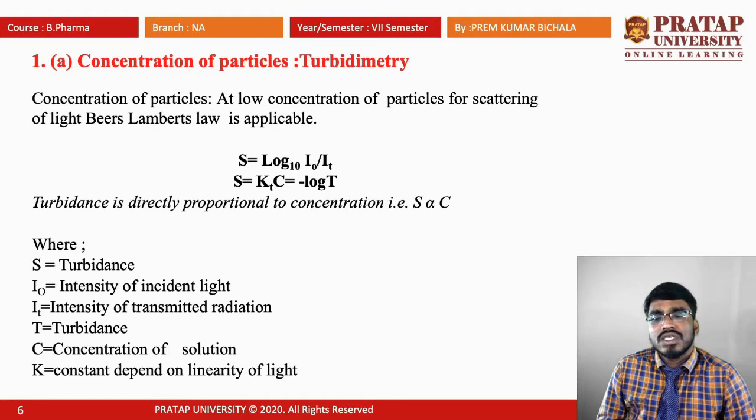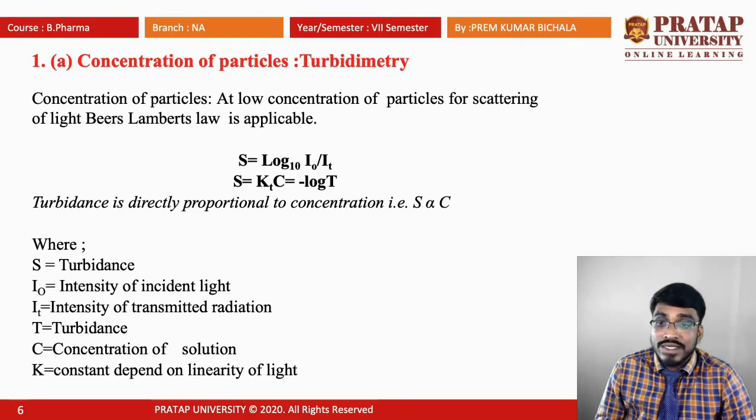Here S stands for turbidity, and turbidity is directly proportional to the concentration, that is S is directly proportional to C, where C is the concentration of the solution. I0 and IT are the intensities of the incident light and the transmitted radiation respectively, and k is a constant which depends on the linearity of light. Sometimes we also use t for turbidity.